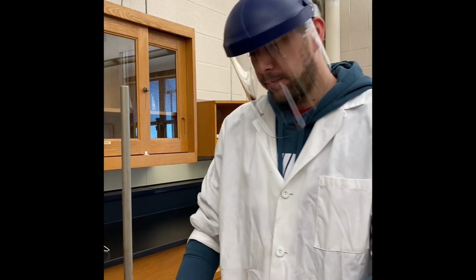In the lab that we're going to do today, I want to have you use experimental data to determine the empirical formula. The compound that we're going to synthesize is magnesium oxide, and so I'm going to show you that reaction first before we start collecting data.